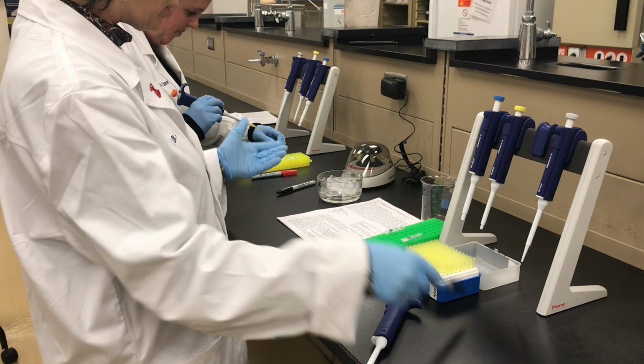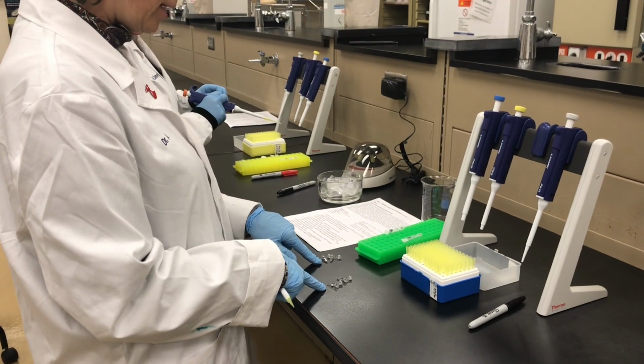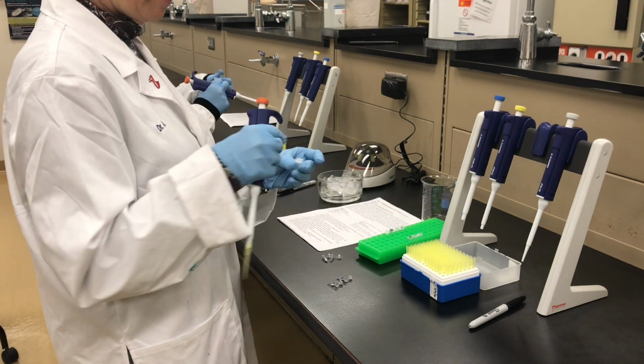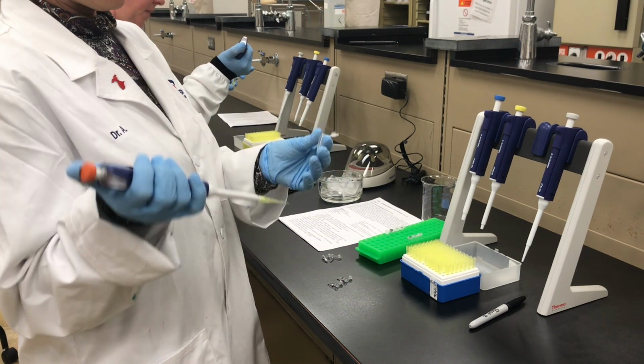Okay, now I'm actually ready for step 3. Into tube 1. Tubes 1s have the little balls of dehydrated enzyme and other good stuff. 20 microliters of primer mix. So we open the little tubes. You might be able to see just that little bit of water in there.